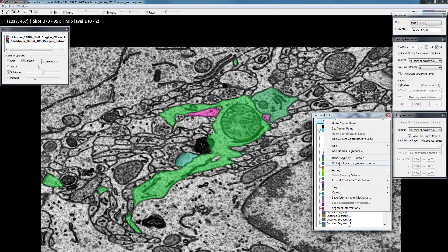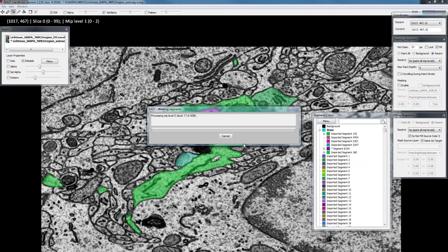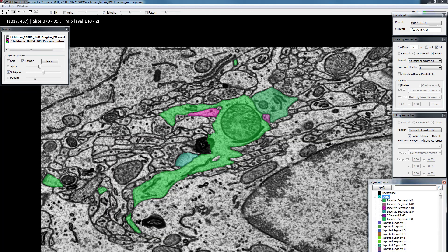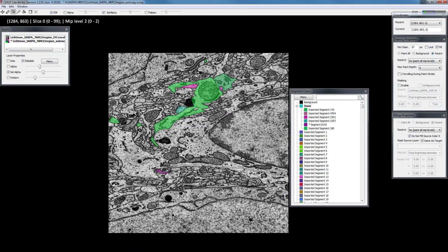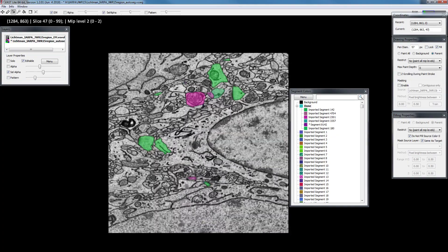I'm going to apply this now — 'Weld collapsed segments in sub tree' — it's asking me if I really want to do that and I say yes. It goes through the whole dataset, finds all the pixels labeled with colors within these folders, renumbers them all to the parent folder, and then deletes the children. Once it's done, all these folders have become single objects — it really welded them into single objects, which corrects all the splits. With these methods you can go through all segments in an automatic segmentation, collect objects that are split, and use manual painting and filling to separate objects that are merged. You collect everything you're done with in the done folder, so you know how much of the dataset you've corrected and what remains to be done.